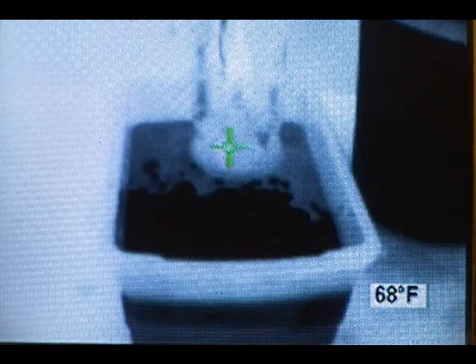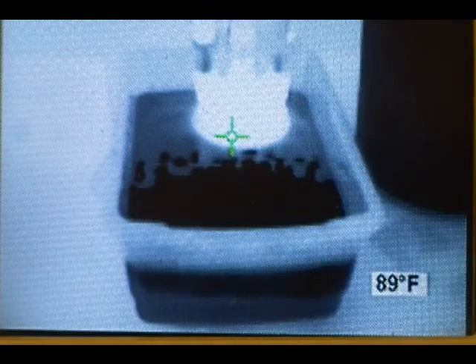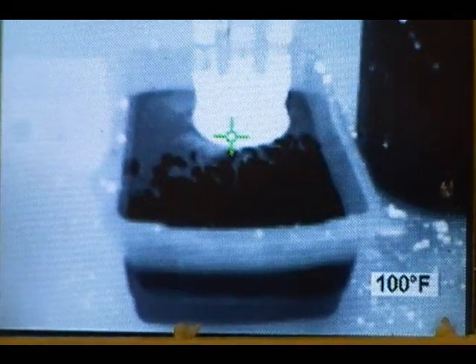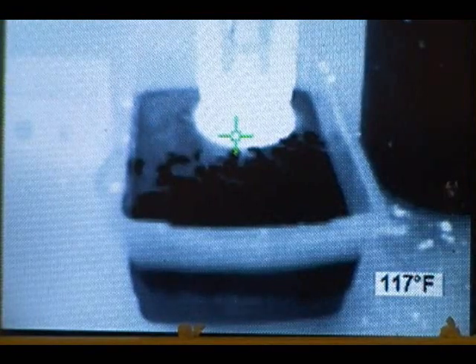Instead of just saying that it can be dangerous, I thought I would show you a runaway reaction by intentionally creating one. You can see the temp going up. The stopper popping off was unexpected and was caused by the pressure building up and snapping the clip that was supposed to hold it in place. So that gives you a good idea of just how dangerous this reaction can be — please use extreme caution.